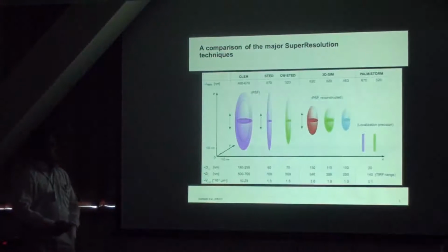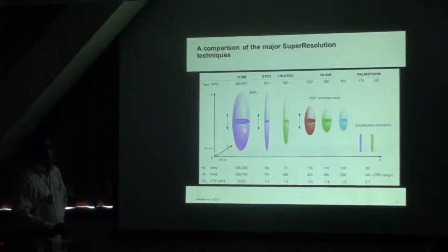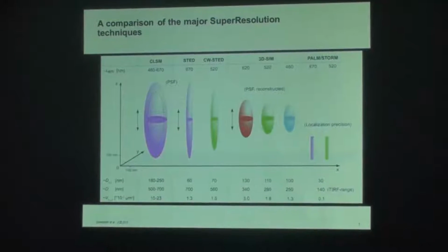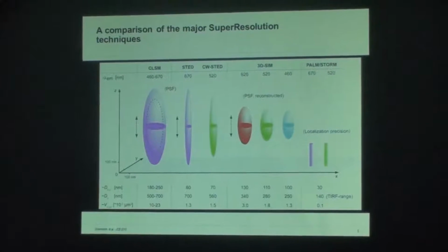Comparing a couple of different microscopy techniques in terms of super resolution available to people: the very commonly used technique in light microscopy is the confocal laser scanning microscope.